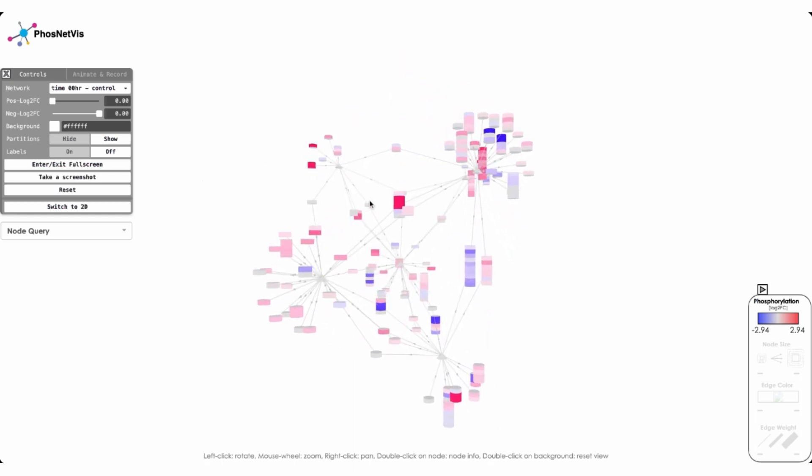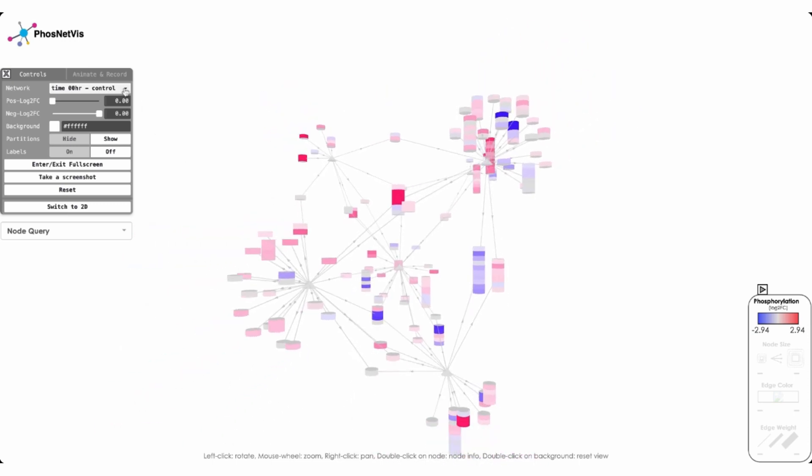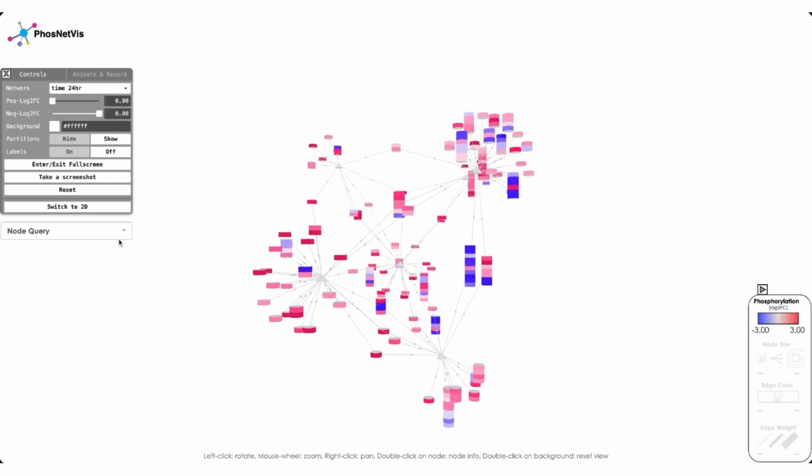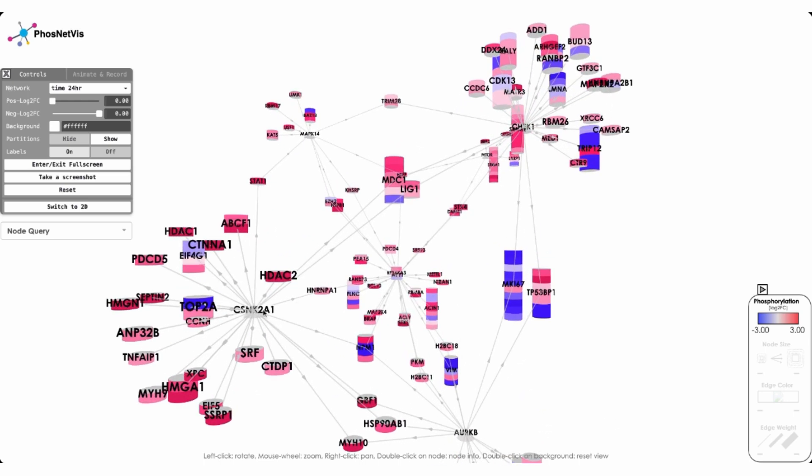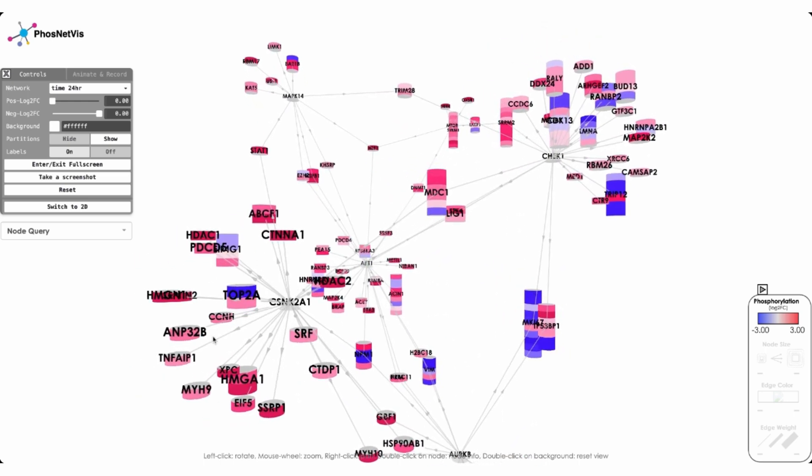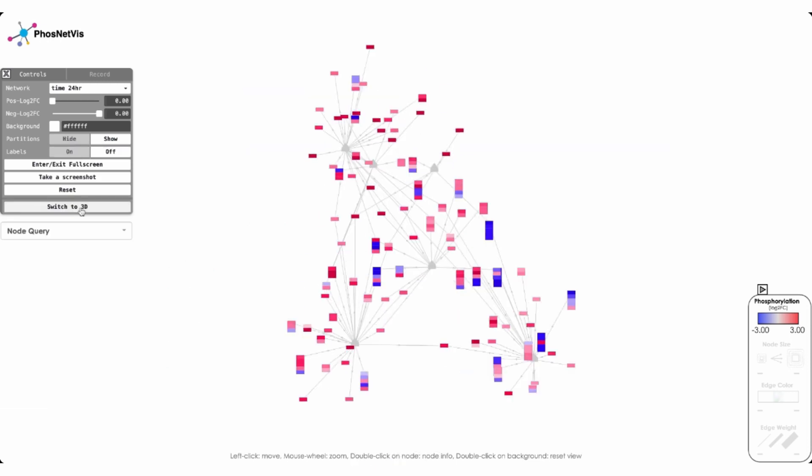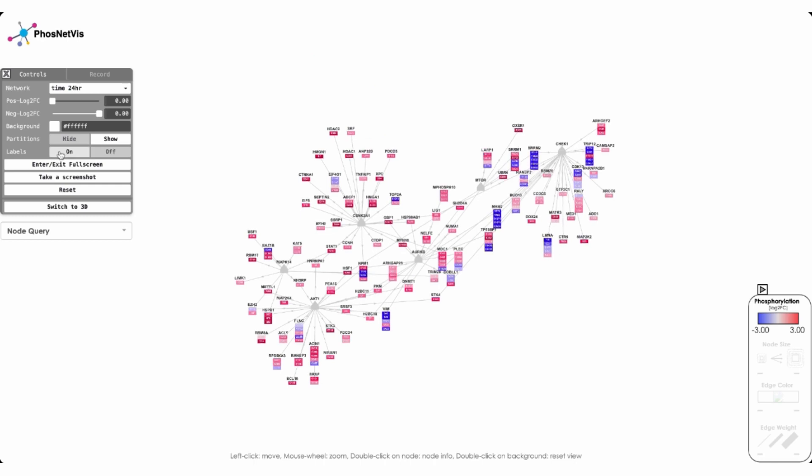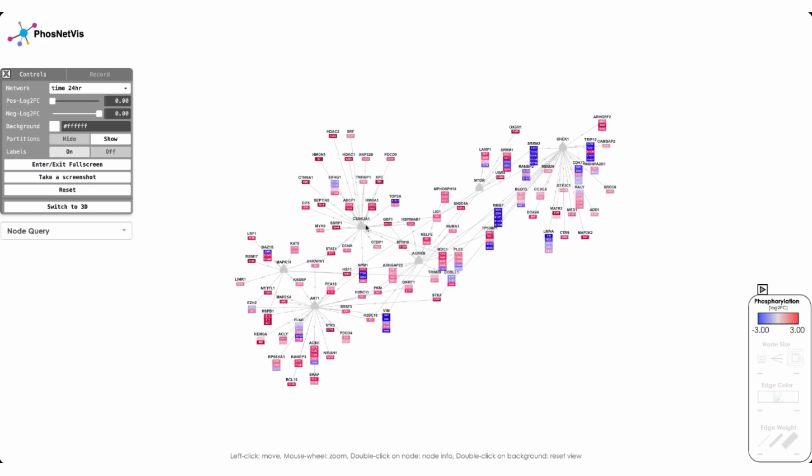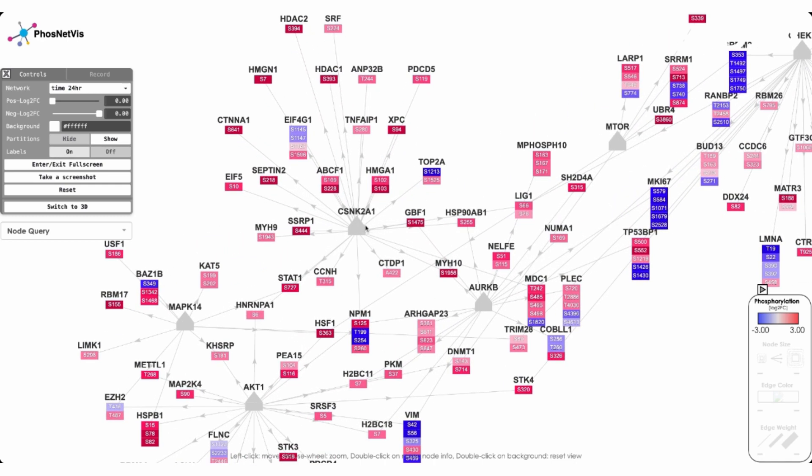So here, this is a time zero of SARS-CoV-2 network, which changes over time. So if we go to 24 hours, these are much more pronounced, for example. And this is a 3D network. And now, we may want to have the labels so that we see what's happening here, CSNK2A1, where the targets of this kinase are predominantly increased in phosphorylation. But we may find 3D a little confusing. So in that case, we switch easily to 2D and then add the labels.